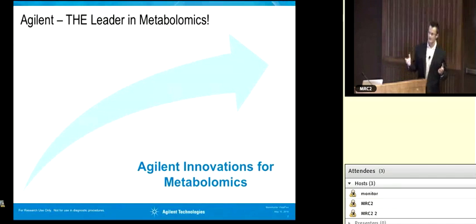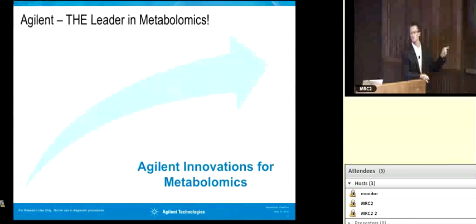Now at this point, that allows you to pick the biology you're interested in, but it doesn't give you much information because at that point in the pathway, it's just a name. It just says D-glucose. And so you need a reference library in order to be able to add some information to what those metabolites are and what they mean. So something like the METLIN library that we have produced with Gary Patti and Gary Siuzdak is very helpful here because it has MS level information, MS/MS, should we need it in the future. It will have structures, it has identifiers, and most importantly, if you've been curating your library appropriately, it will have retention times because you need those for the isotopolog extraction.